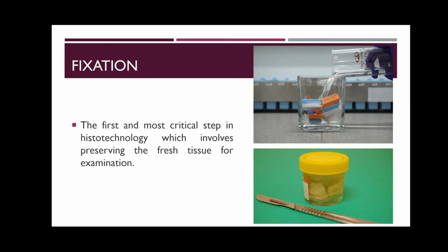The cell, of course, is composed of what? Proteins, carbohydrates, lipids, and other organic and inorganic substances. Fixation prevents degeneration, decomposition, putrefaction, and distortion of tissues after removal from the body.